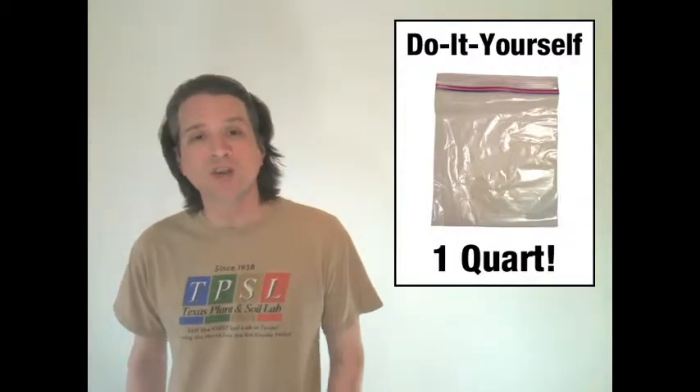But if you don't want to pay full retail for a mail-in kit or a dollar for a little paper bag, we're going to let you know how you can do it yourself with a one-quart size plastic resealable bag that you probably already have in your kitchen.